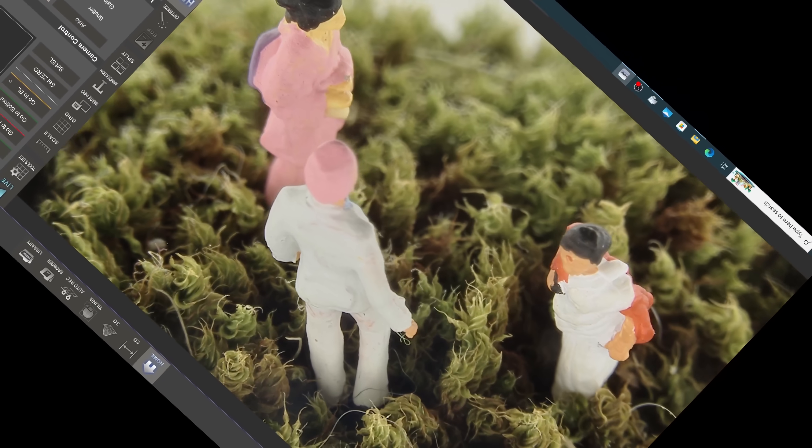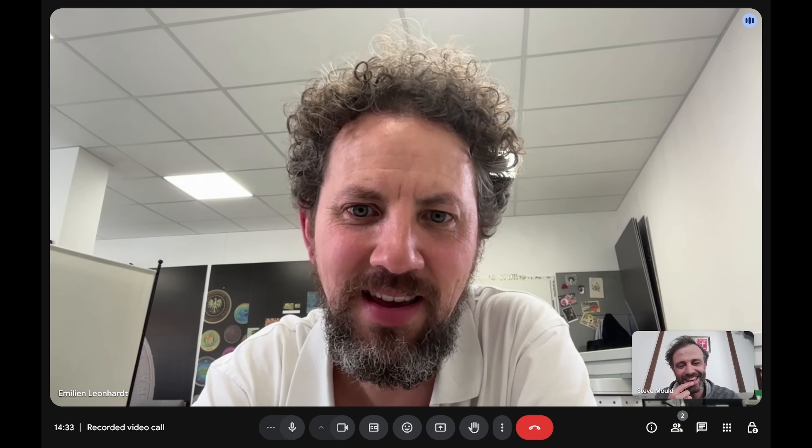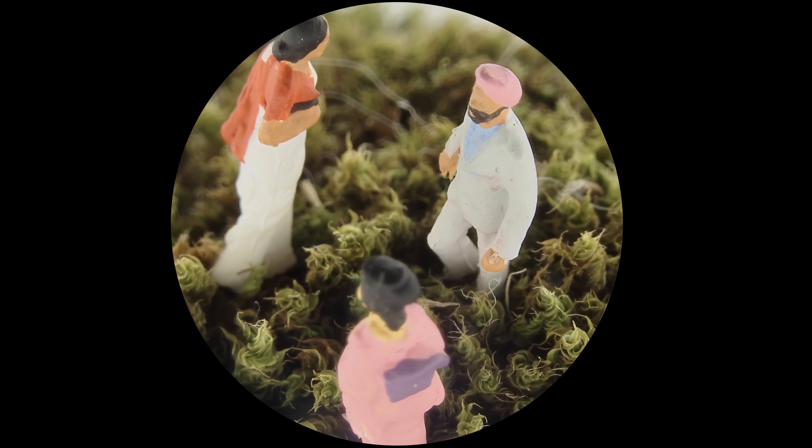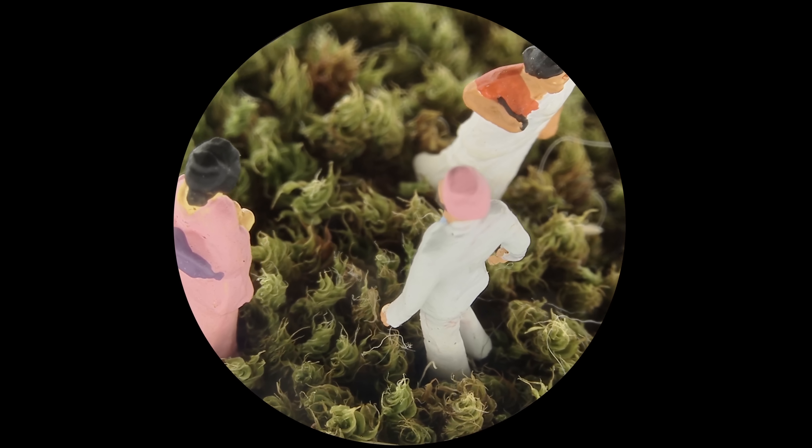How cool is that? This looks exactly like drone footage — very cinematographic. I will definitely ask for this feature from Hirox. This would be amazing.